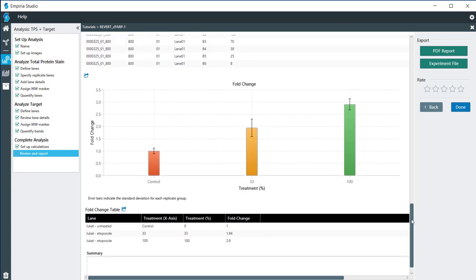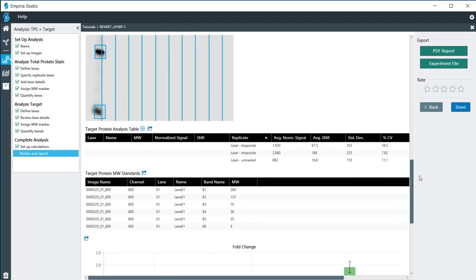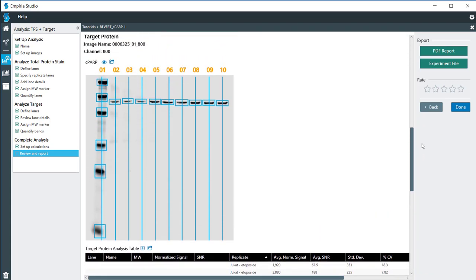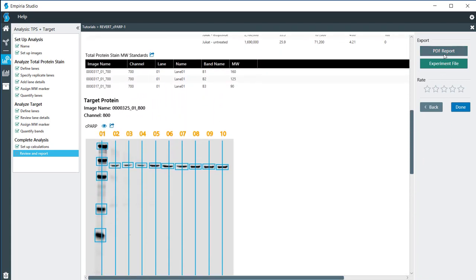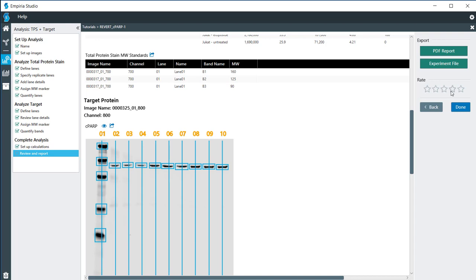At this point, if we want to export these data, we can either do it as a PDF report or an experimental file to take to another computer for someone else to visualize. You can also rate the experiment. If everything came out exactly as expected, you can go ahead and click on five. Or if it was not quite as expected, you can click on anywhere below that. Thank you.